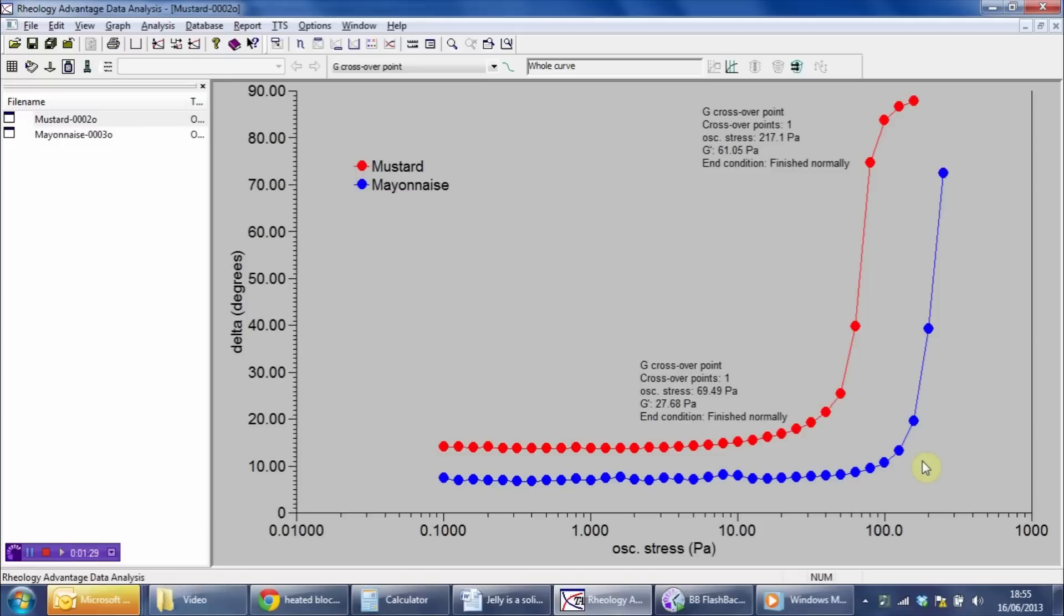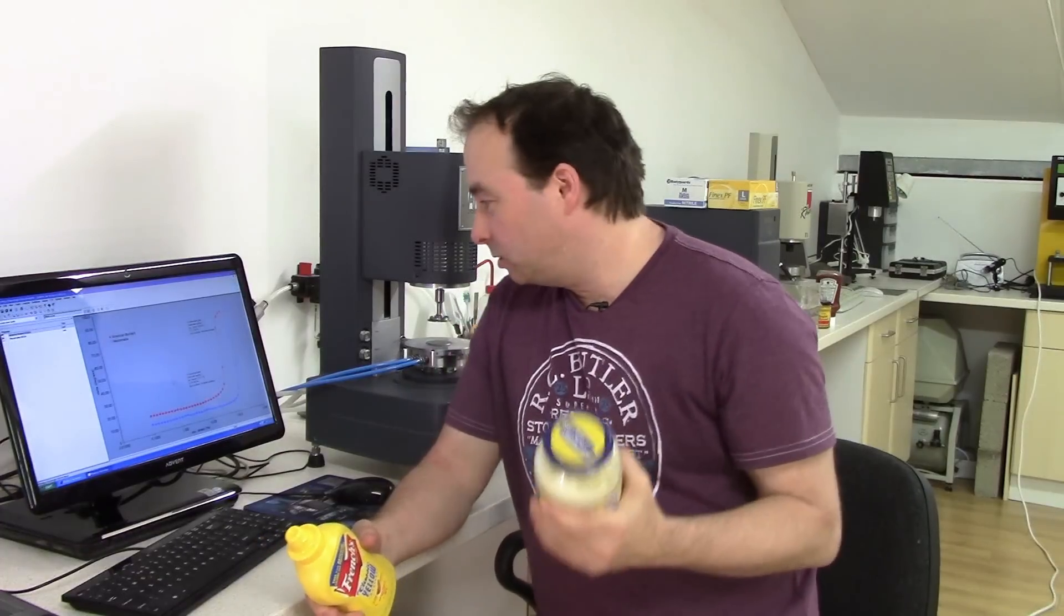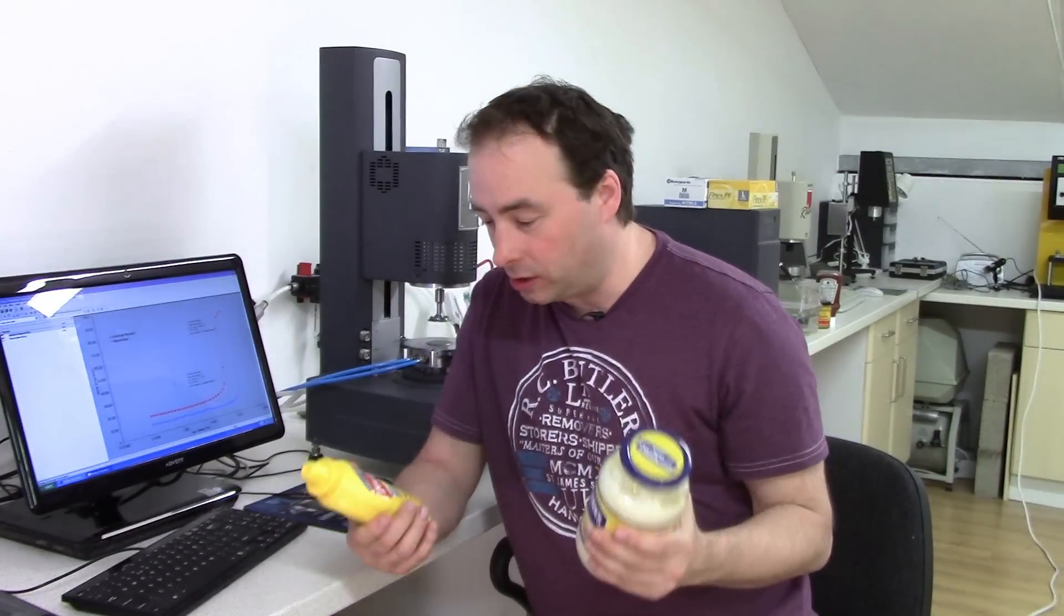So what we've done here is we've performed a test that has applied some very gentle stresses to our samples, identified that there's some structure present—that's the low phase angle value we're getting here for both of these samples—and then identified the stresses that are required to disrupt that structure, signified by the rise of the phase angle, the ongoing yield. So the mayonnaise has a yield stress of around about 217 Pascals. The mustard has a yield stress of only 70 Pascals. That means that the mayonnaise is three times stronger than the mustard.